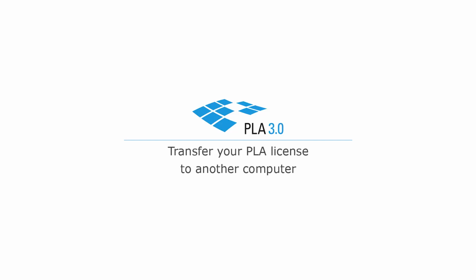The procedure shown in this video applies to PLA licenses based on software keys for PLA 3.0 and also PLA 2.1. For information on hardware or hard lock keys, consult our guide on planning installation and licensing.